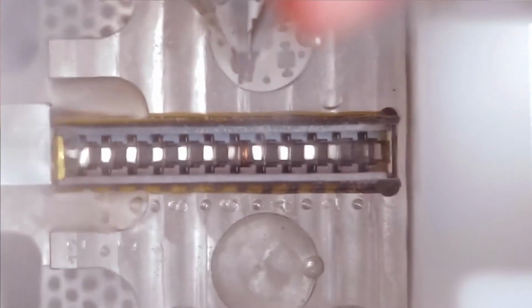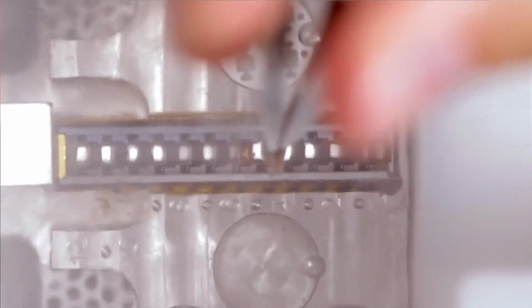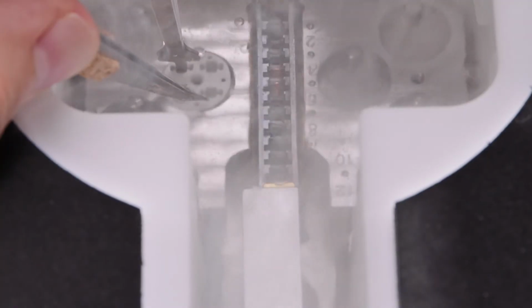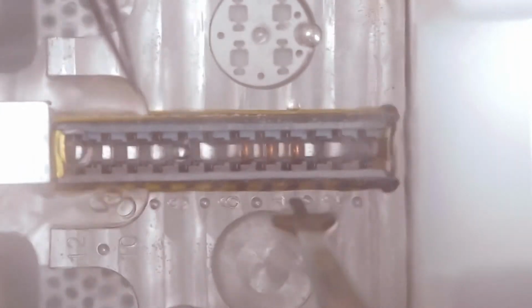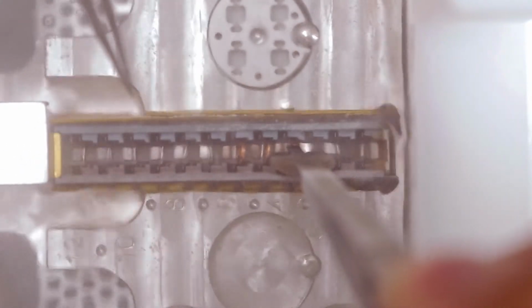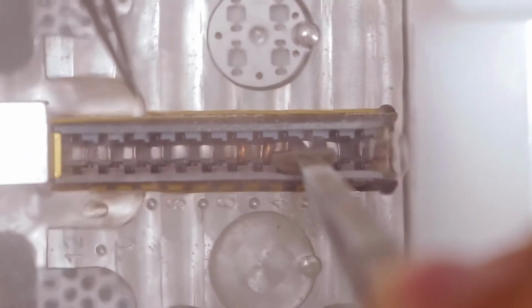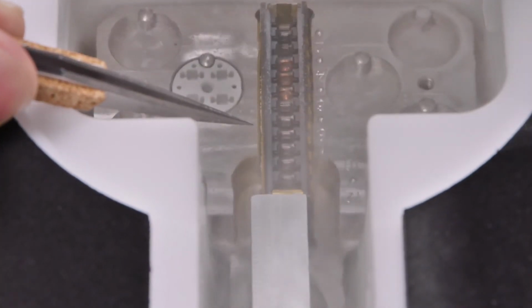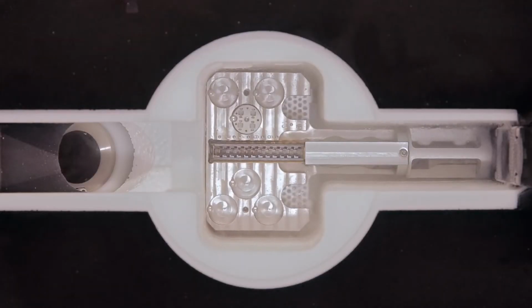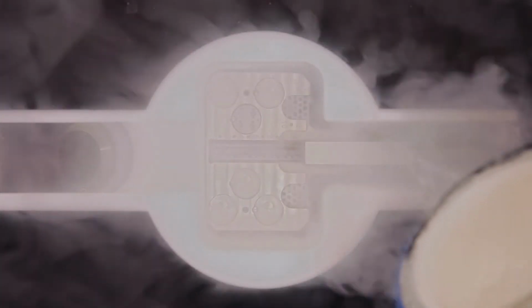So I'm holding the grid box down with a pair of tweezers. All three grids have now been loaded, and I'm checking these grids by tapping them down in their respective slots. We can now refill with some liquid nitrogen, and we also refill the capsule a little bit with some liquid nitrogen.